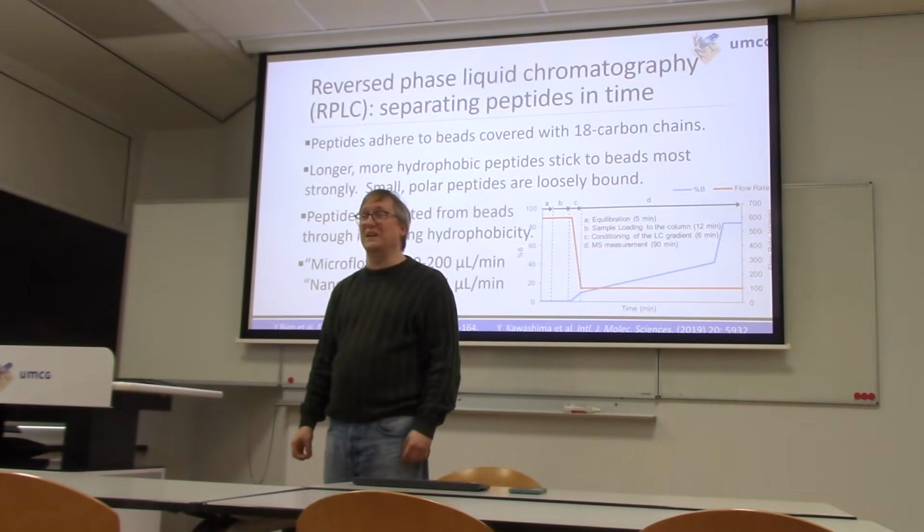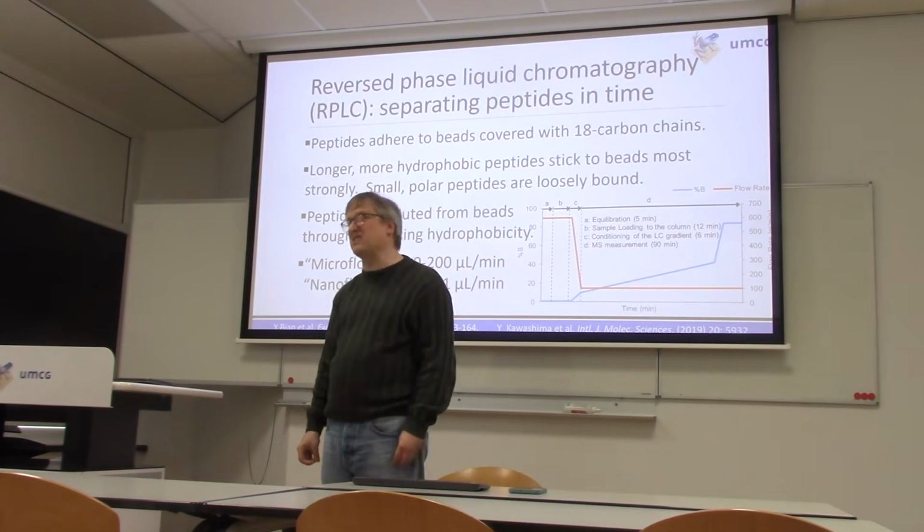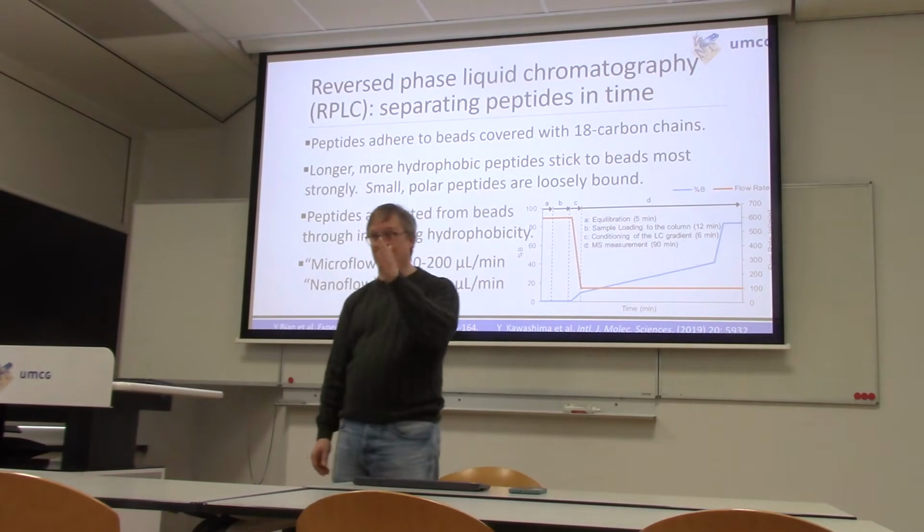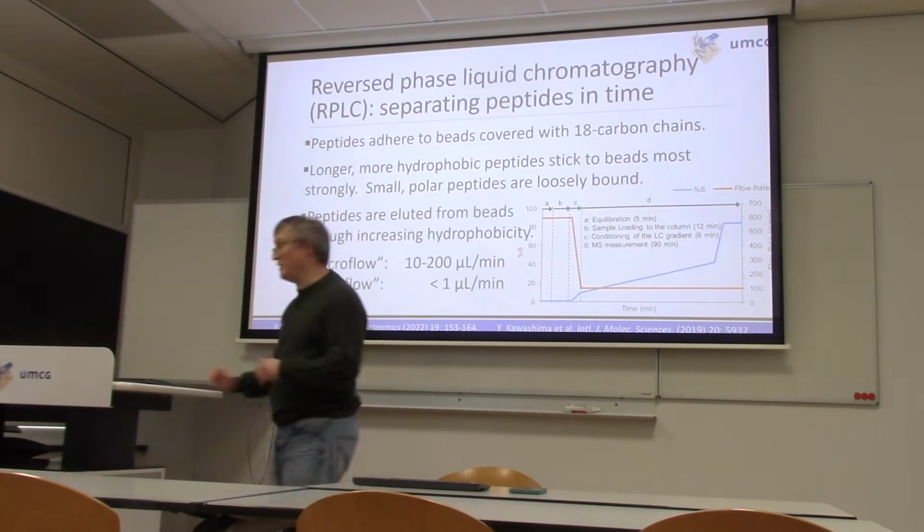Short version: you've got to get proteins out of your sample. You've got to disrupt those proteins so you can digest them. You digest them with trypsin, now you've got peptides. They need to become ions and be separated in time. We're finally to the part where we talk about the mass spec.